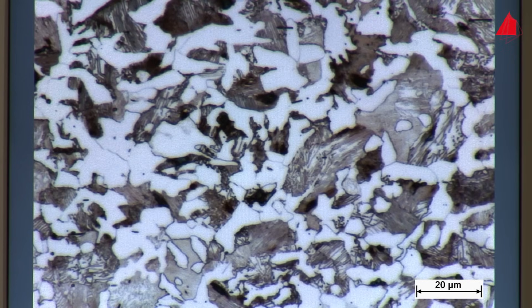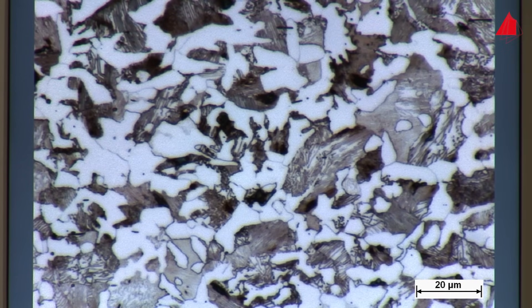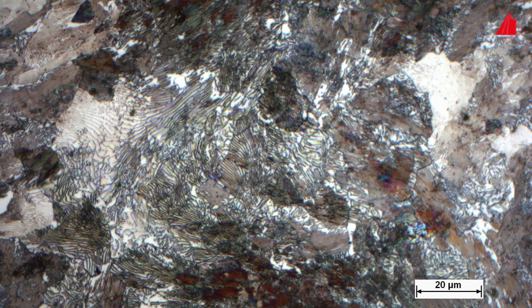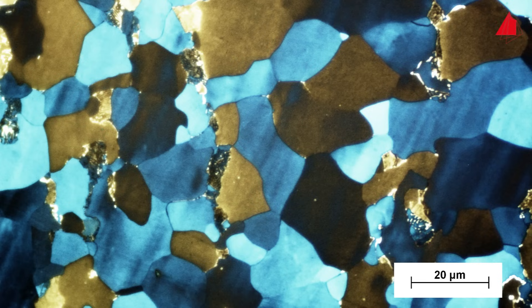In a similar manner, virtually all materials of our world may be examined. This is the plain carbon steel C80 with 0.8% of carbon. Only perlitic regions with their characteristic alternating layers of ferrite and cementite can be seen. And this is the plain carbon steel S235 after a colour etching. It only has a low carbon content. The relative amount of differently coloured ferrite crystals is high, the proportion of perlite regions low.